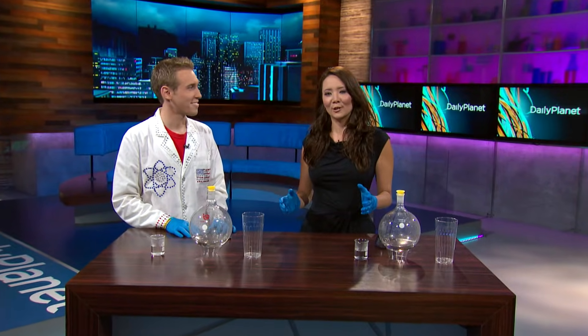Christmas is around the corner and if you're like me you love those ornaments that go on the trees. Today we're gonna learn how to make Christmas ornaments with chemistry, and with me here is Jeffrey Vinicoris from UCLA.